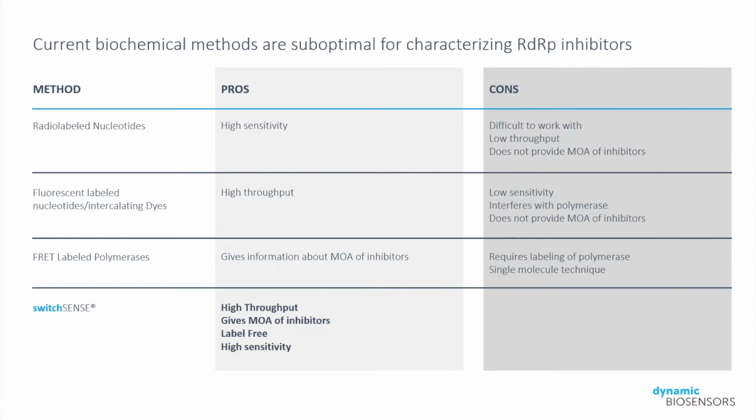They have limited throughput, and without significant assay development, you have a problem studying the mechanism of action of any inhibitors of polymerases.